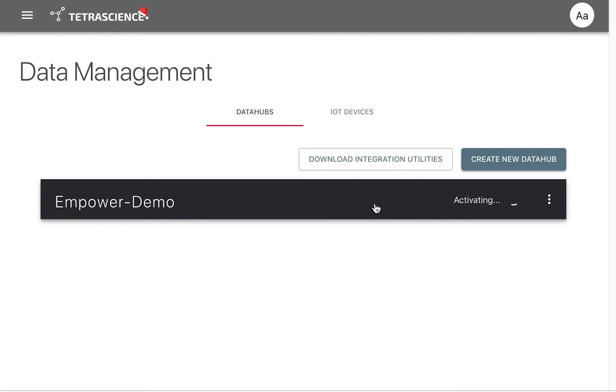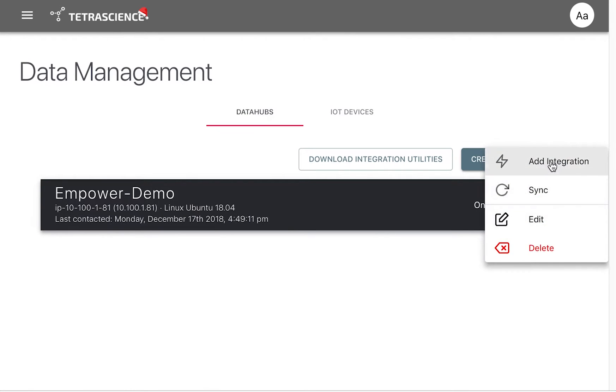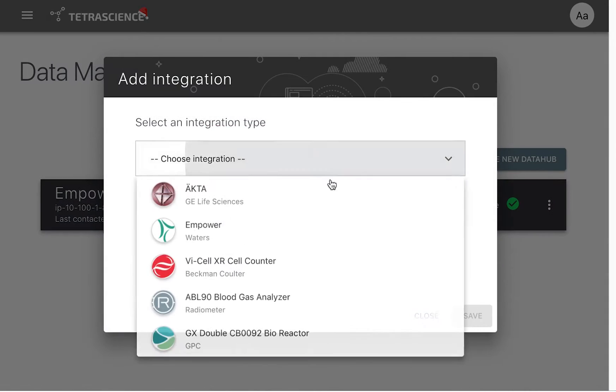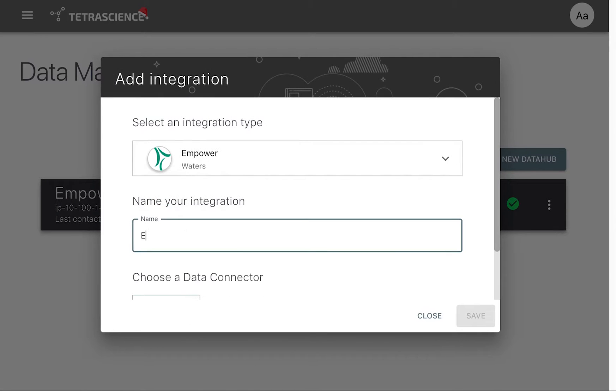From this page, users may monitor the status of all their connections. Next, we will integrate Empower and associate it with the Data Hub we just set up.